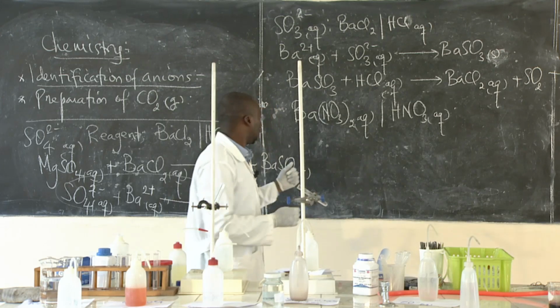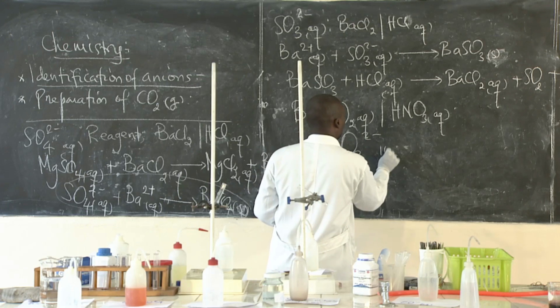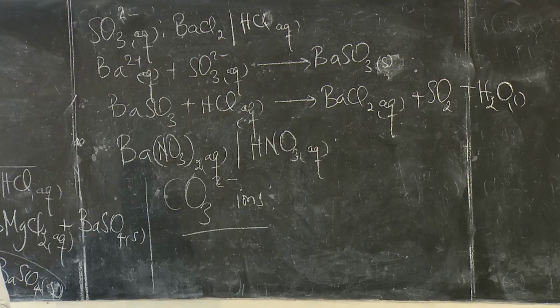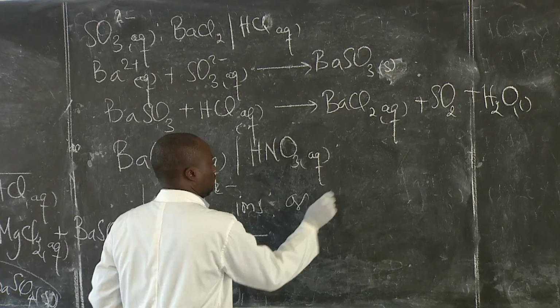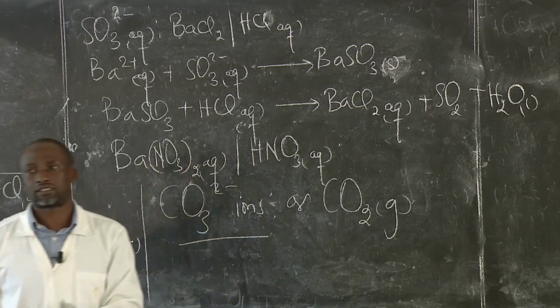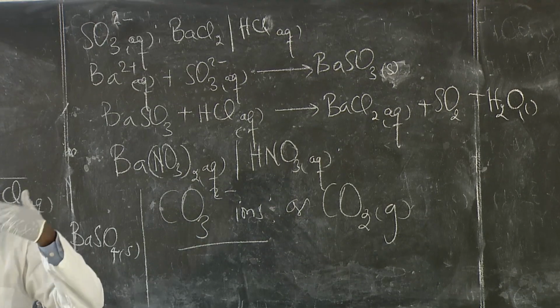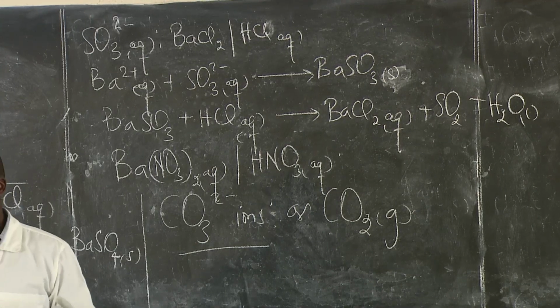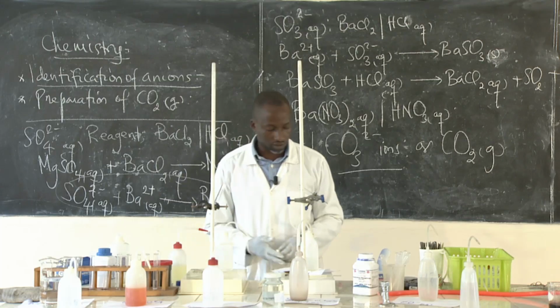So we are just going to continue and then look at the carbonate ions, or the carbon dioxide gas. So we have to prepare carbon dioxide and then test that gas. So this is what we do.